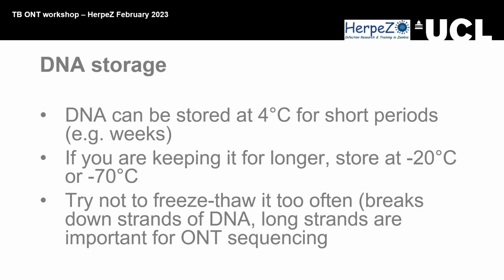So yeah, as I say, we're not going to do CTAB as part of this, but if you want to talk about CTAB and how best to optimize it, have a look through the methods and see if it's different, and we can talk about maybe trying to optimize it. And hopefully in the next few weeks and months, we might have this new optimized ONT version of the protocol, which might work even better and hopefully eliminate whatever it is that seems to be inhibiting sequencing of TB or whatever is done with CTAB. And then maybe we should be able to put more samples on per run and hopefully make it cheaper as well. So yeah.